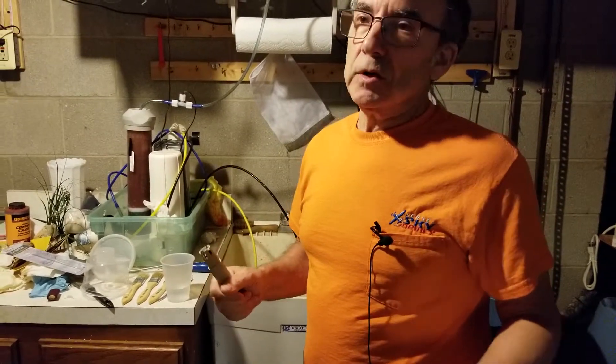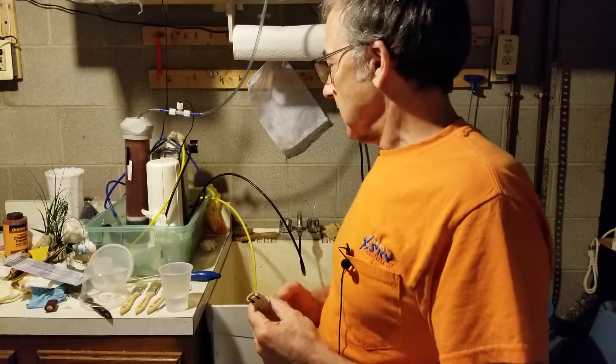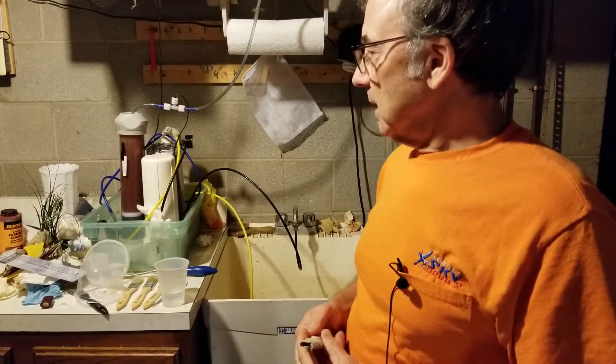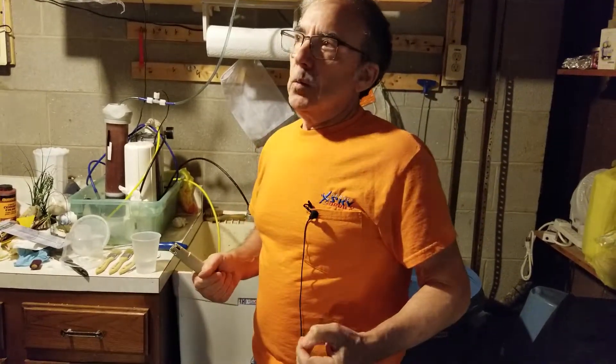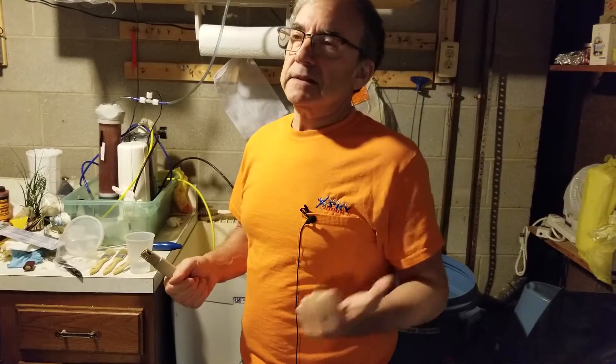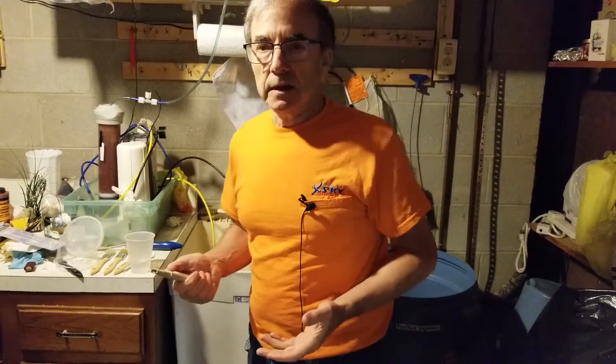That's actually very soft water — there aren't a lot of total dissolved solids in the tap water. I've found it necessary to add a product called Equilibrium when I'm mixing up water for my planted aquarium because it's really too soft for the fish, and even the plants want a little bit of total dissolved solids. What's coming out of my faucet is on the low side, so I boost it up with Equilibrium.